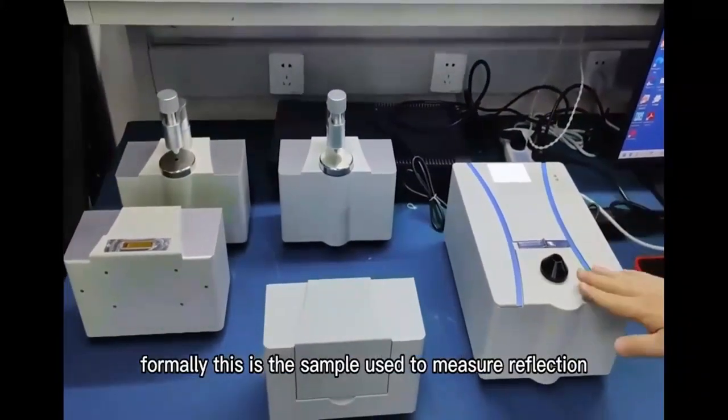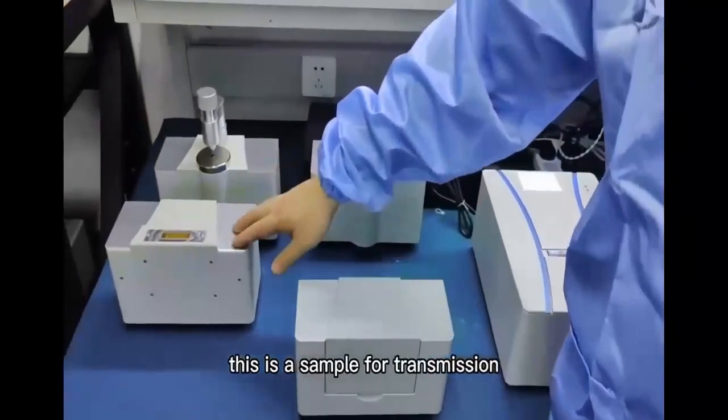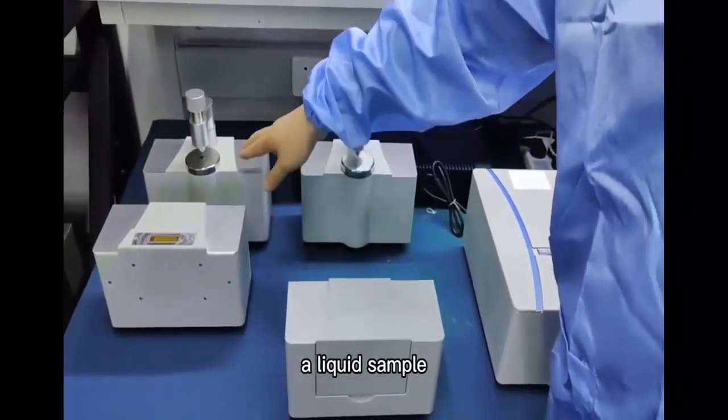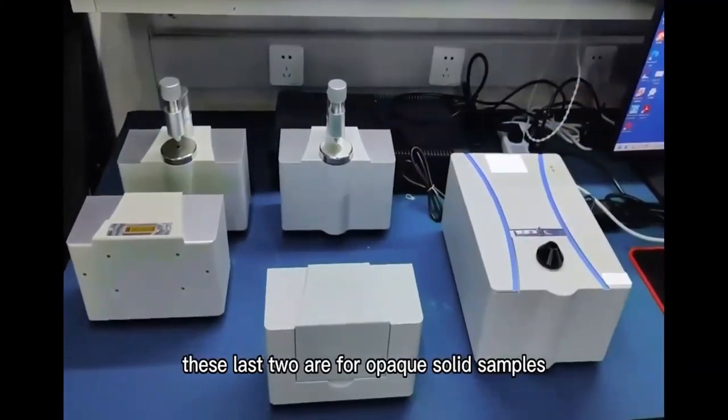Normally, this is the sample used to measure reflection. This is a sample for transmission, a liquid sample. These last two are for opaque solid samples.